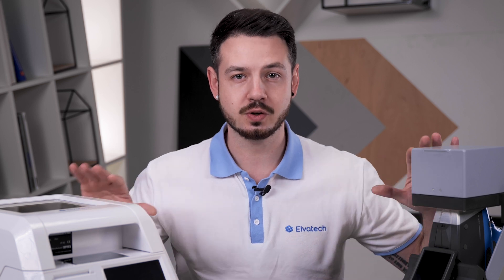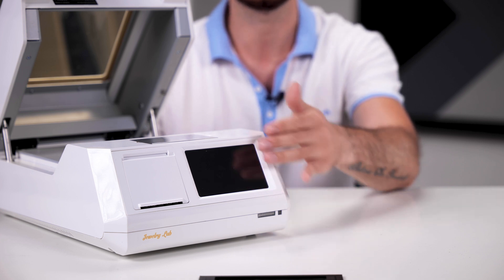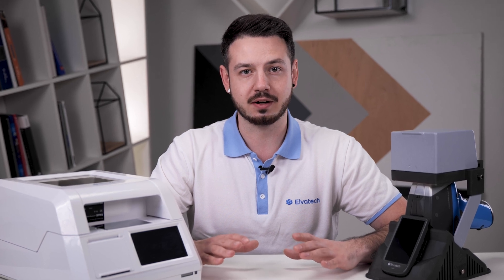Let's take a closer look at two analyzers that can help you with jewelry and precious metals analysis. The first analyzer is the Jewelry Lab — a benchtop spectrometer designed specially for analyzing precious metals. The body is made of durable plastic, with lead glass built into the lid to monitor the analysis process, a client-facing display inside the measuring chamber, a touchscreen display and printer on the front panel, and high-precision built-in scales accurate to hundredths of a gram. The second analyzer is the Prospector 3 — the most compact, lightweight and fastest analyzer on the market, with its main distinction being compactness and mobility.